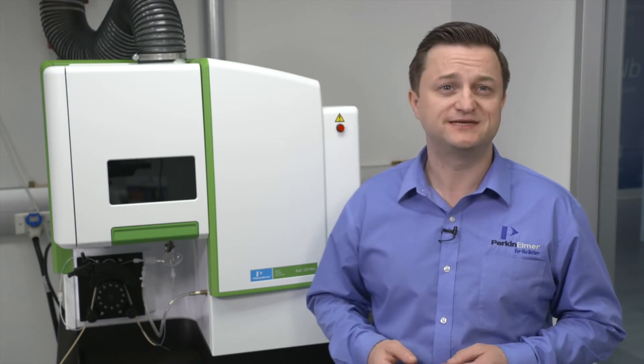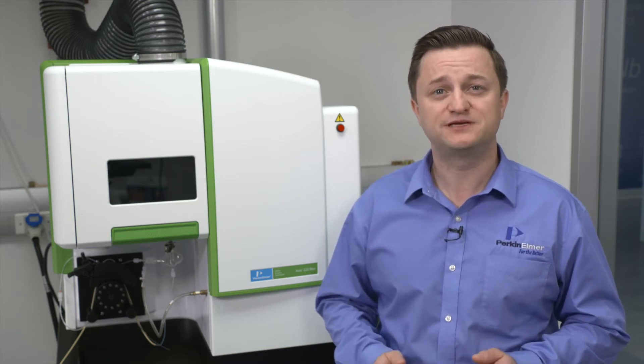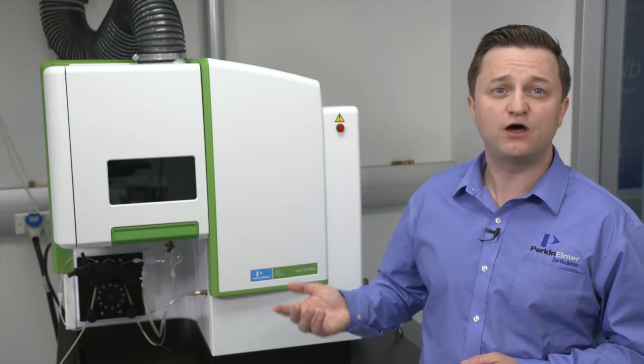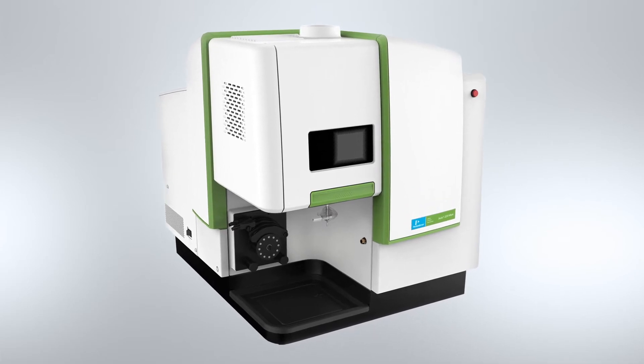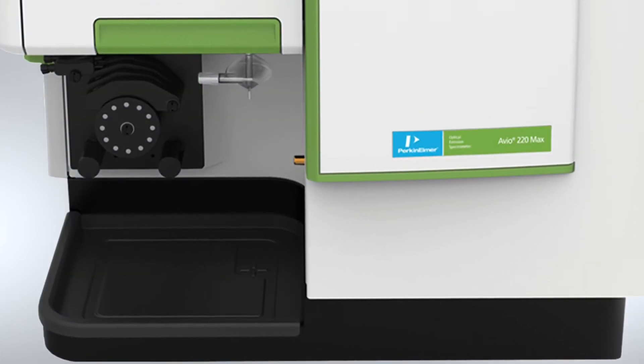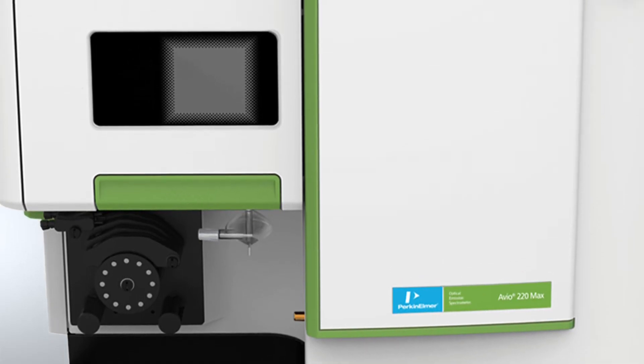For some labs, sample volumes and workloads aren't an issue, but fast turnaround times on single or multi-element analyses are still essential. For these labs, the intuitive, easy-to-use, hybrid-simultaneous Avio 220 Max system is often the right choice. It's a plug-and-play, low-maintenance, high-uptime solution for small to medium-sized labs with big ambitions. The Avio 220 Max is the only ICP solution providing fast start-up and simultaneous measurements, giving you all the throughput and flexibility you need. Plus, this plug-and-play instrument is simply the fastest ICP OES — from a cold start to analysis in just 10 minutes. With little or no maintenance for critical technologies, this is an ICP OES that delivers exceptional uptime and productivity.